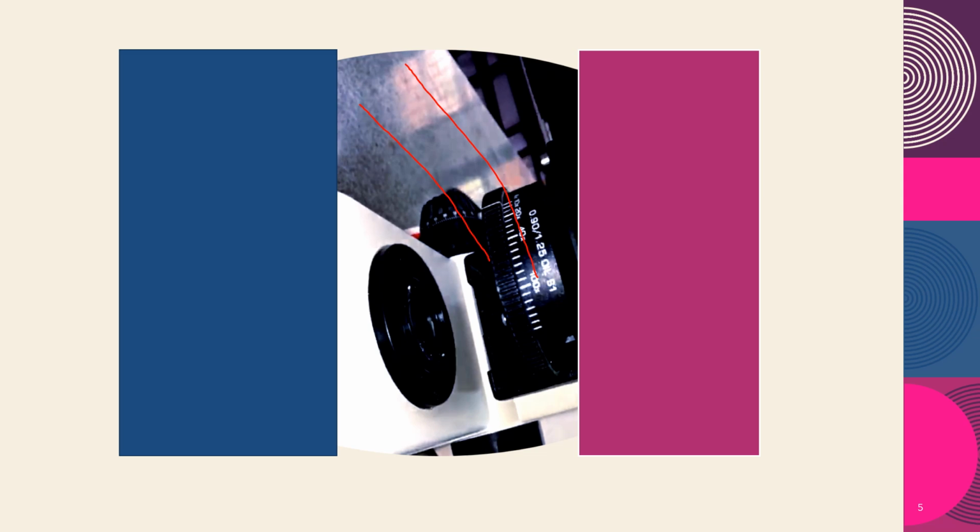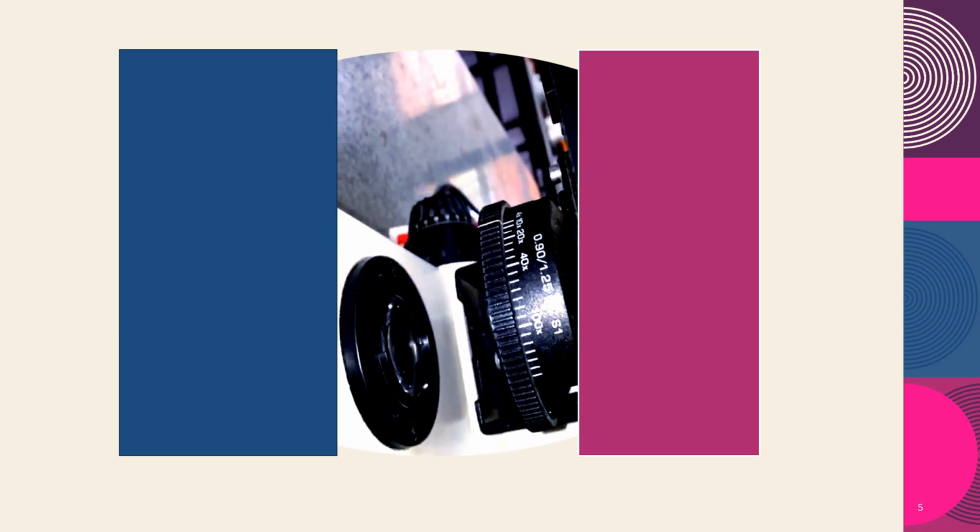The condenser has a system of lenses inside that focuses the light that passes through onto the specimen on the stage, which is further focused onto the ocular lens and then finally focused onto our retina for us to see the image. So what we see here is the condenser and the iris diaphragm.